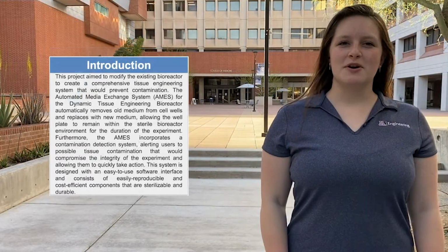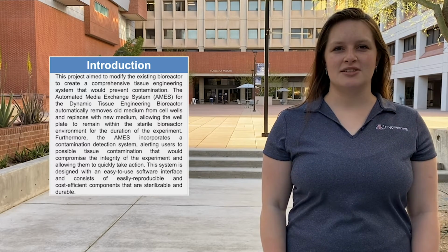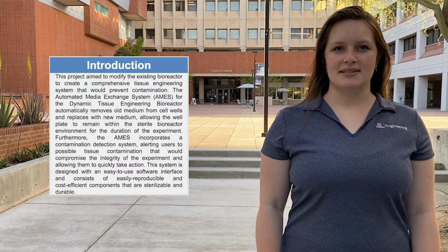The previous bioreactor required users to remove the cartilage tissue from the sterile system every time the medium is exchanged, which presented the opportunity for contamination to be introduced. This project aimed to modify the existing bioreactor to create a comprehensive tissue engineering system that would prevent contamination.